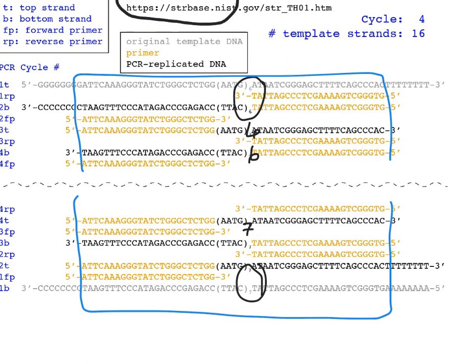We just need to know. We're going to load a gel next digitally on the slides. We need to know what we expect the lengths of these 2 PCR products are going to be. Does everybody understand the instructions or have questions about this? Okay, go for it.